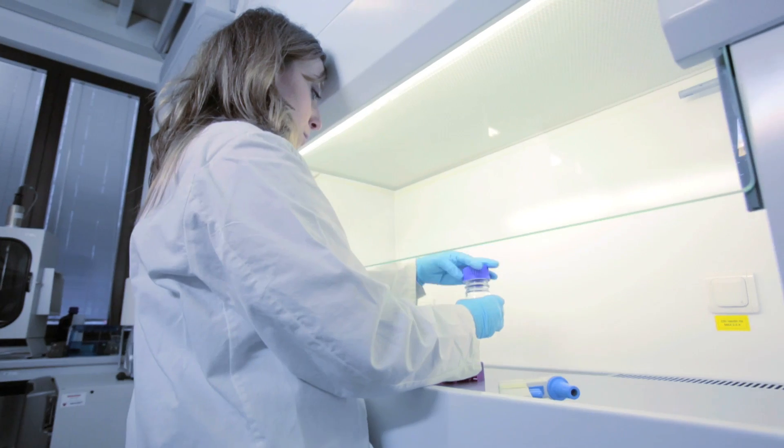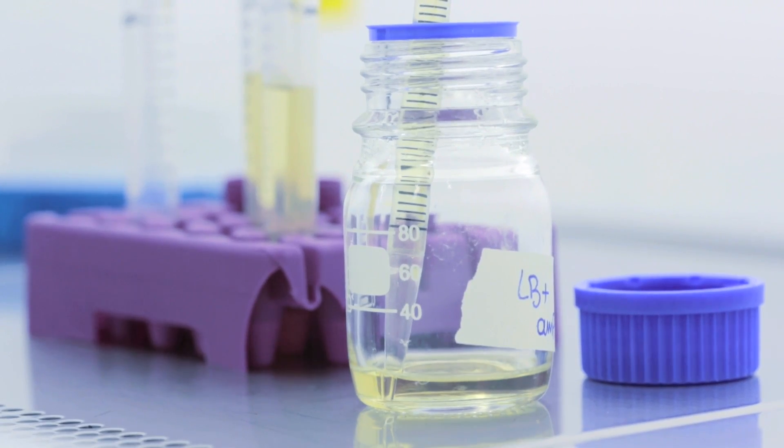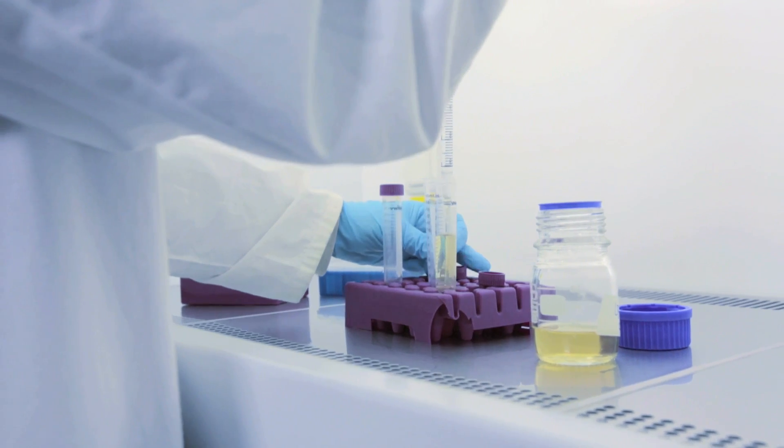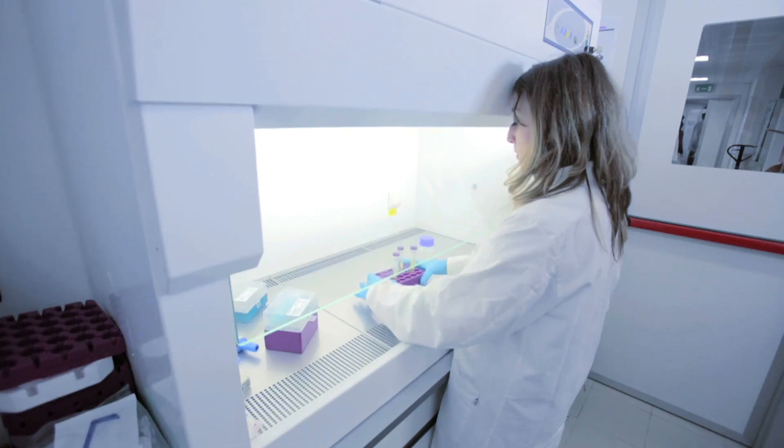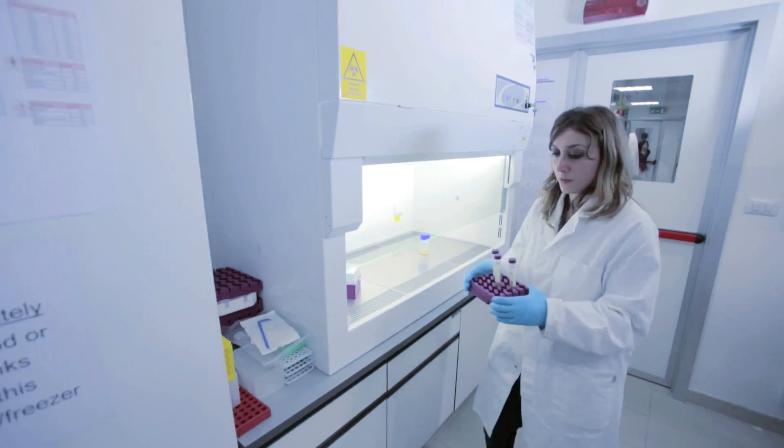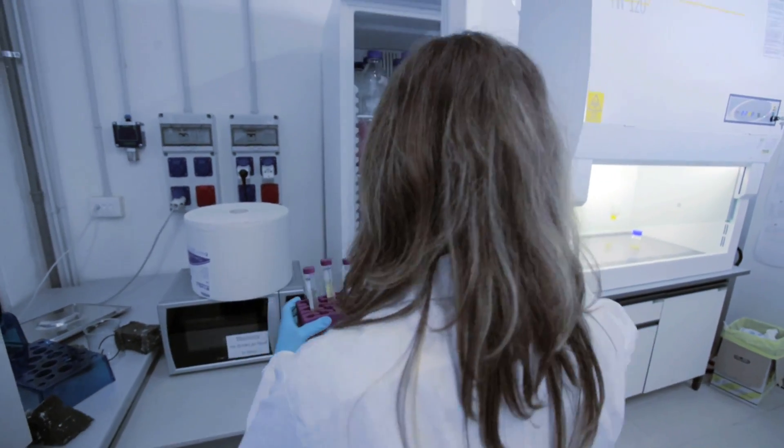In order to perform this kind of study, preliminary screening is very important for us to understand the better conditions for the growth of bacteria for the production of the protein of interest. In fact, the production of the protein is dependent on many different parameters such as the medium of growth, concentration of inductor, temperature, the strain that we use, the pH, and so on.